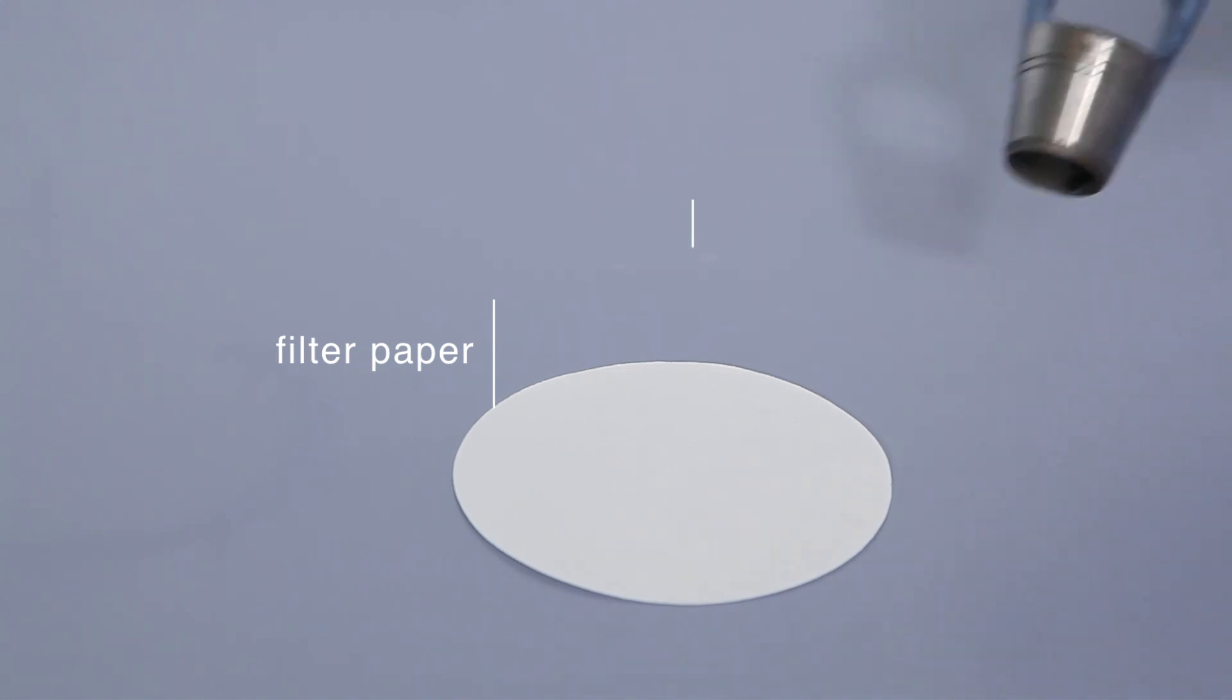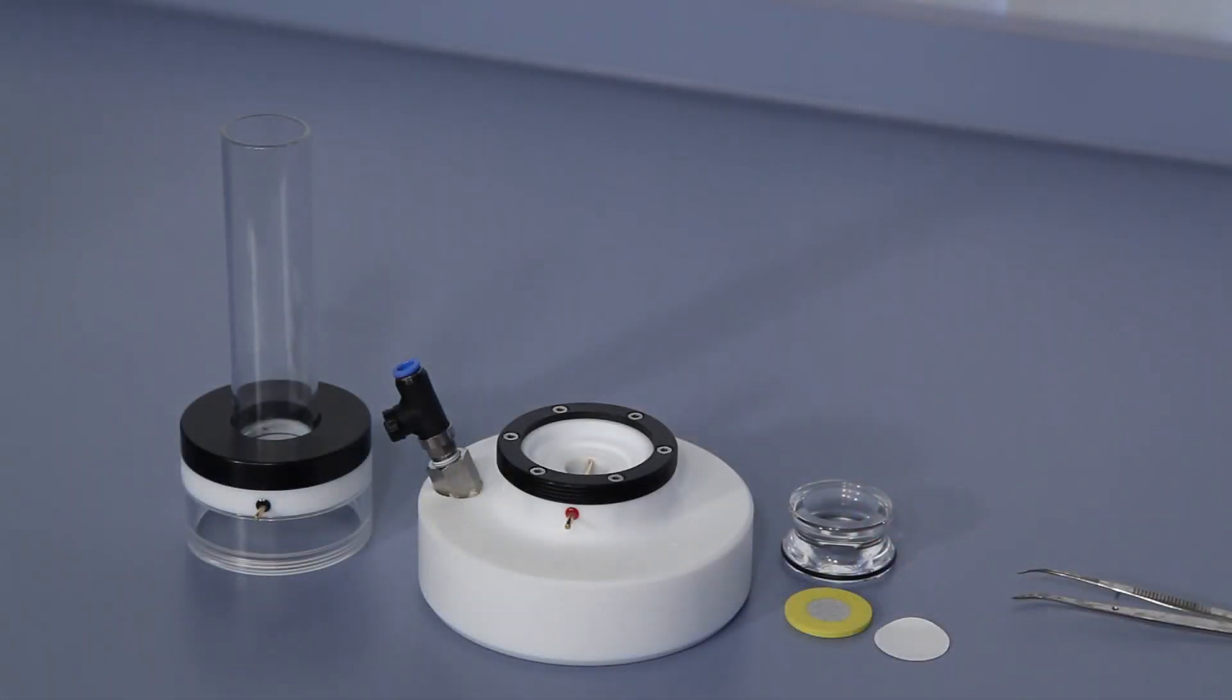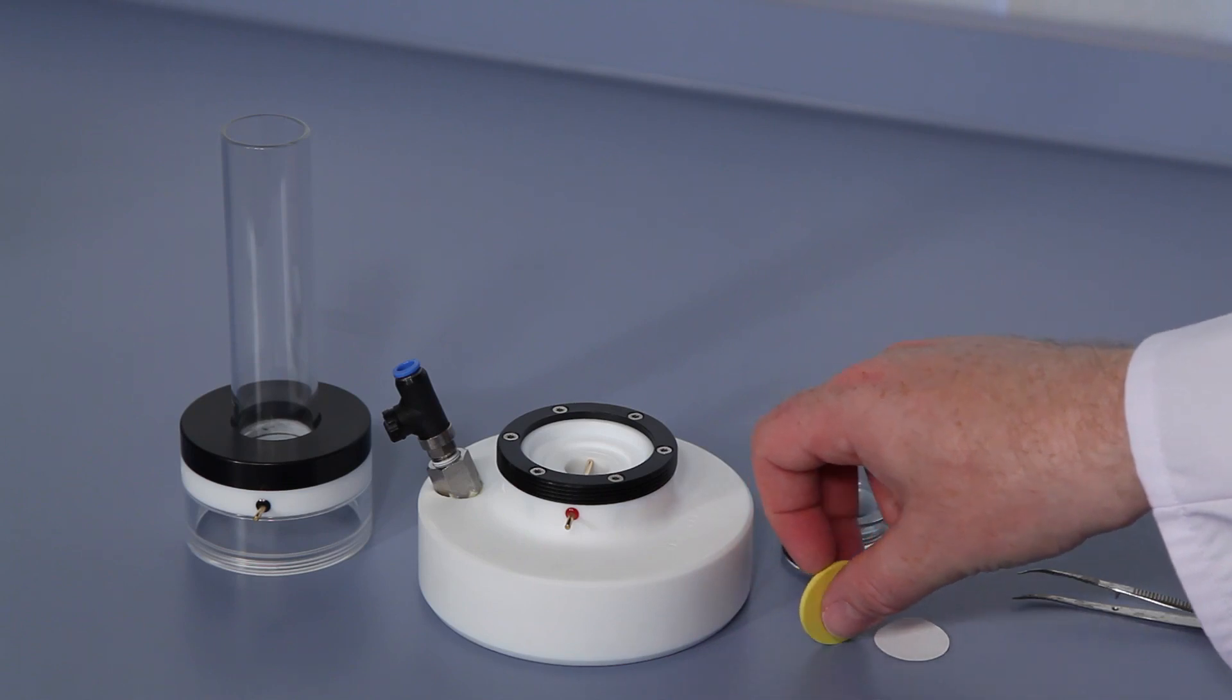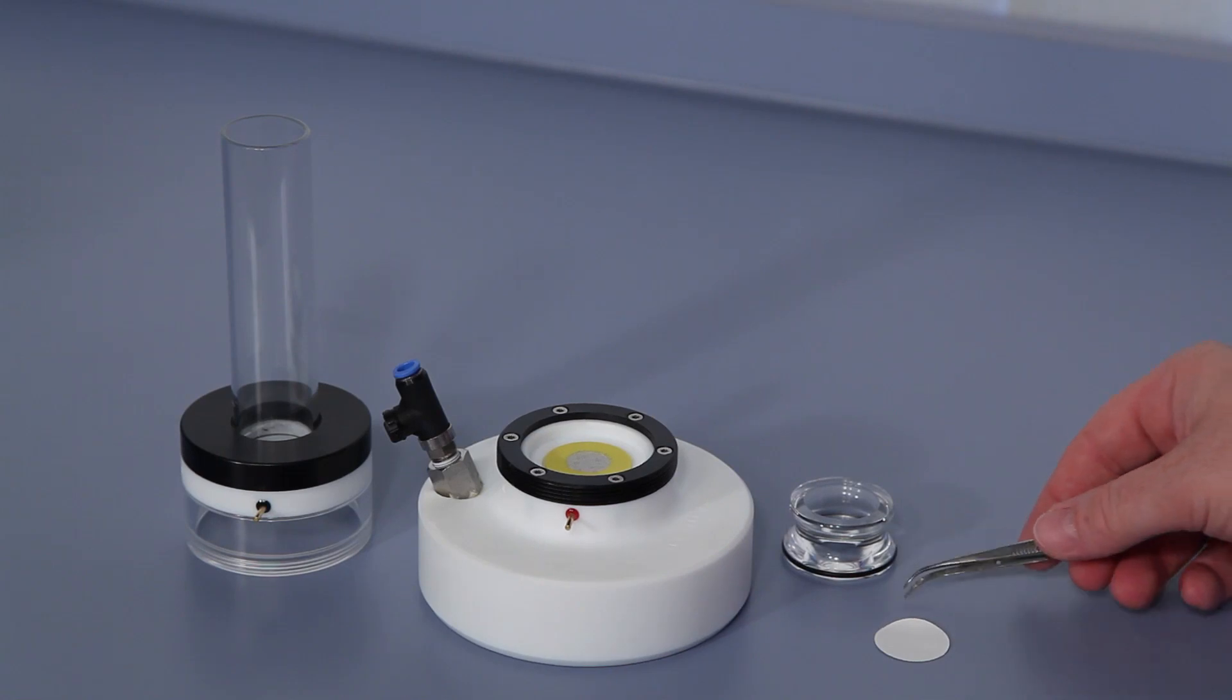Use the supplied punch to cut out a paper filter. Then, insert the yellow screen in the measuring cell with the flat side upwards, and place the filter paper on the screen.